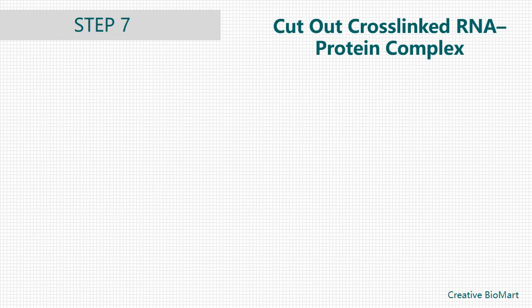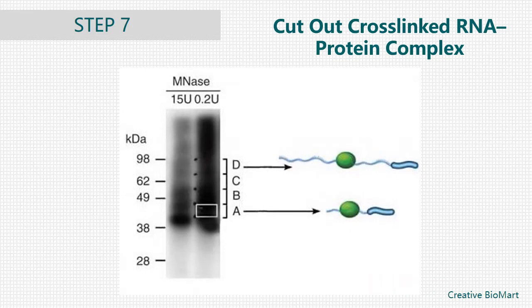Step 7, Cut Out Cross-linked RNA-Protein Complex. The RNA-protein complexes run at approximately the combined molecular weight of the protein and RNA. Using a scalpel blade, cut out this band, and then cut the nitrocellulose into small pieces. Place these pieces into a single clean tube.